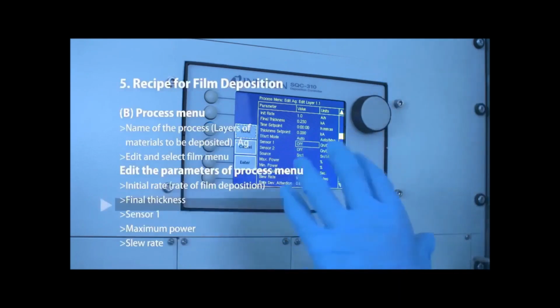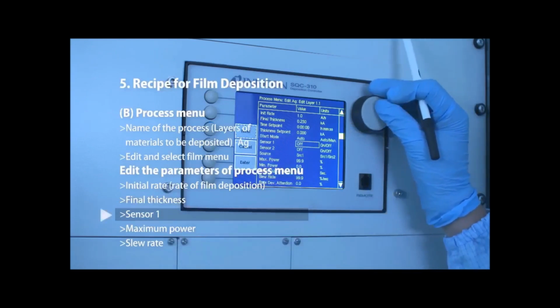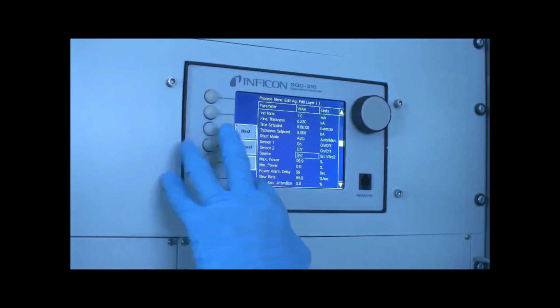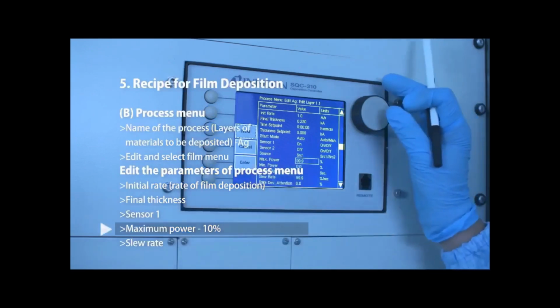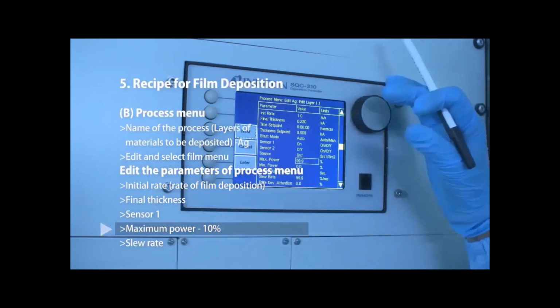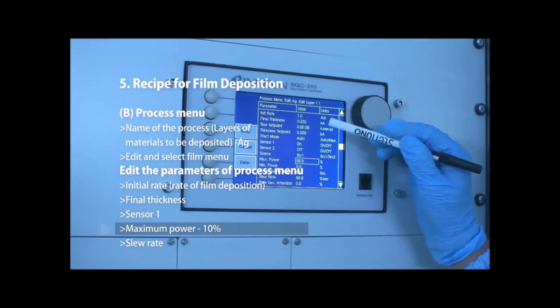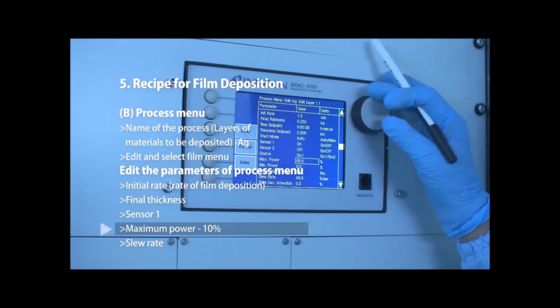Here is the sensor. Sensor 1 is the QCM, so we have only one QCM inside the chamber, so we have to turn it on. This is the source 1, or electron beam source. This is the maximum power which we have to supply through the tungsten filament in order to attain this rate of deposition of 1 angstrom per second. So let's put 10%.